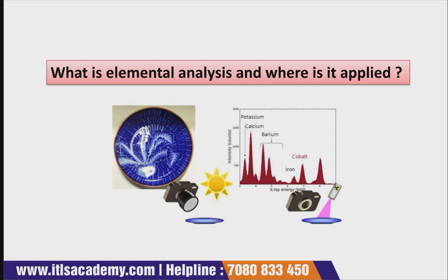We have studied X-ray fluorescence, atomic absorption spectroscopy, and ICP, that is inductively coupled plasma. All these techniques are widely used in laboratories for analysis of any sample of interest.